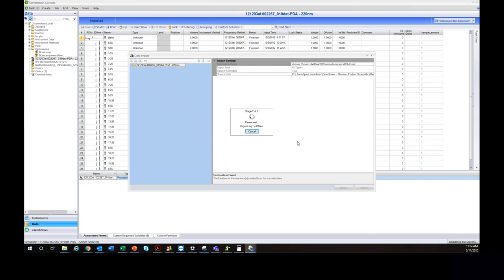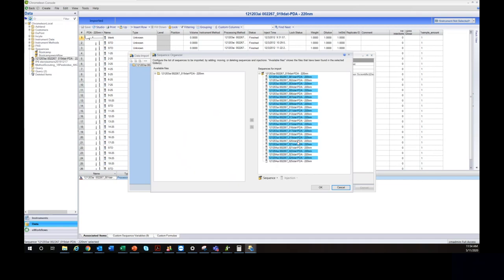Be patient — the import can take a minute or so depending on sequence size, number of injections, and whether there's 3D data. It's correlating everything and checking for duplicate files. When you import, depending on the file format, some things may carry over — component names, retention times, some generic information. But since Chromeleon uses a different algorithm, you won't get the same detection settings.